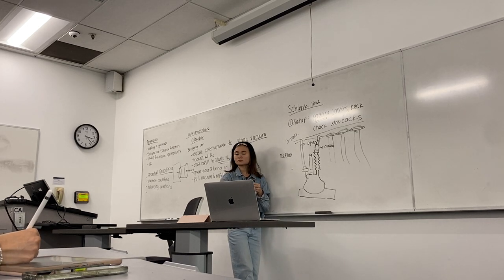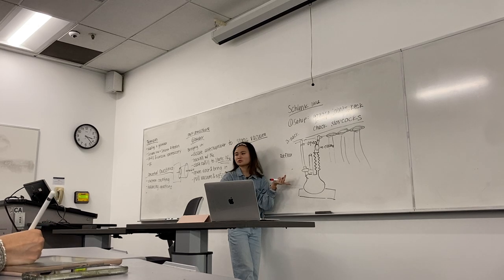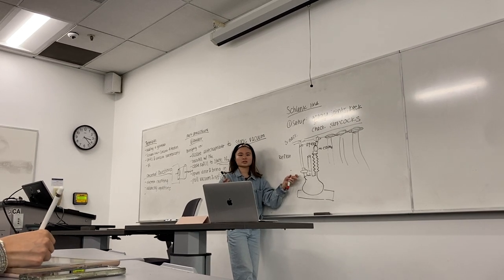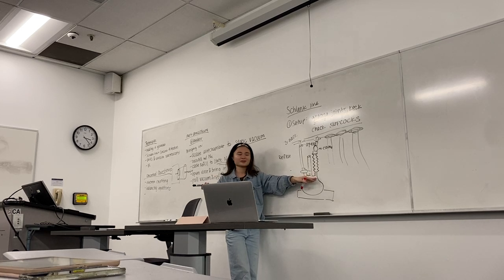Was the left side nitrogen going in, or is that vacuum? This is the nitrogen inlet. So let's just assume that there's only nitrogen right now. A lot of people I would see forgot to close the nitrogen inlet when you start reflux. The nitrogen inlet is there because, in some cases this was just a septa and then you swapped it out for a condenser, or in some cases it was just there.